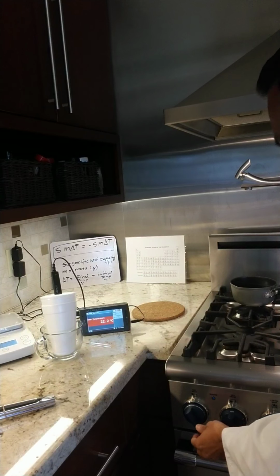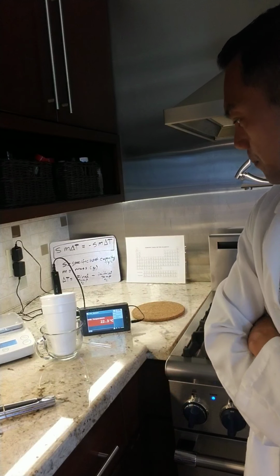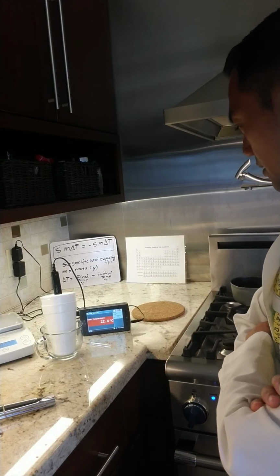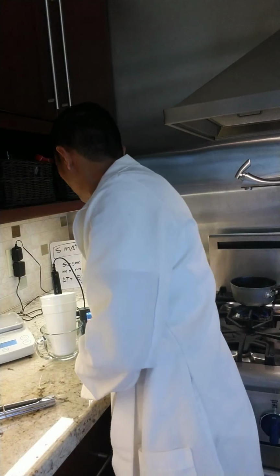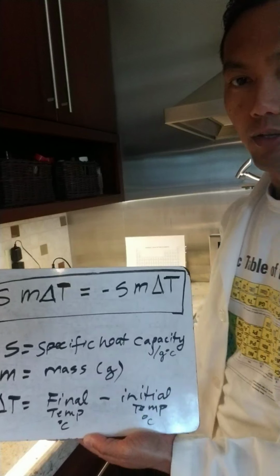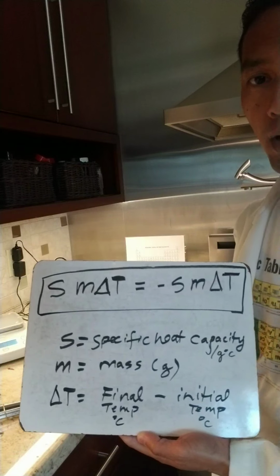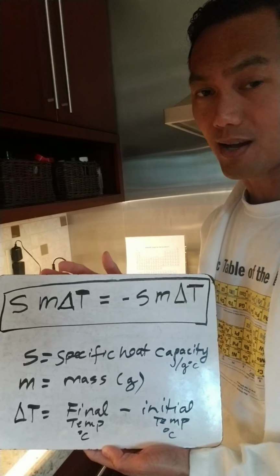And then kind of keep that boiling while we're doing the first experiment. All right, so while we're waiting, let me remind everyone again how this formula pertains to our calculation. Again, the ones on the paper, the S was represented by C rather than S, but it's the same exact thing.